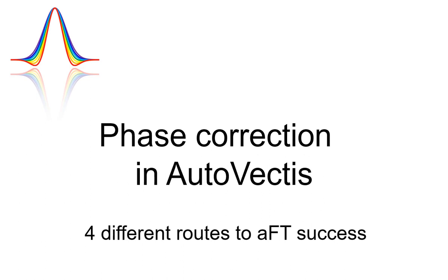In this video I'm going to demonstrate the different methods that you can use in Autovectus to solve the phase correction function so that your FTMS data can be shown in absorption mode.